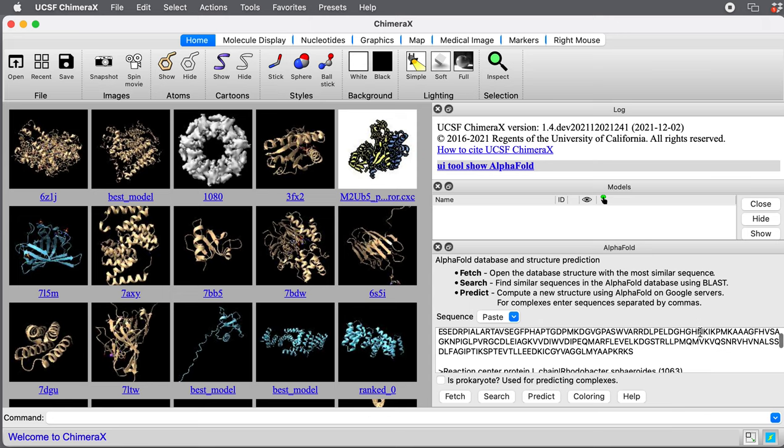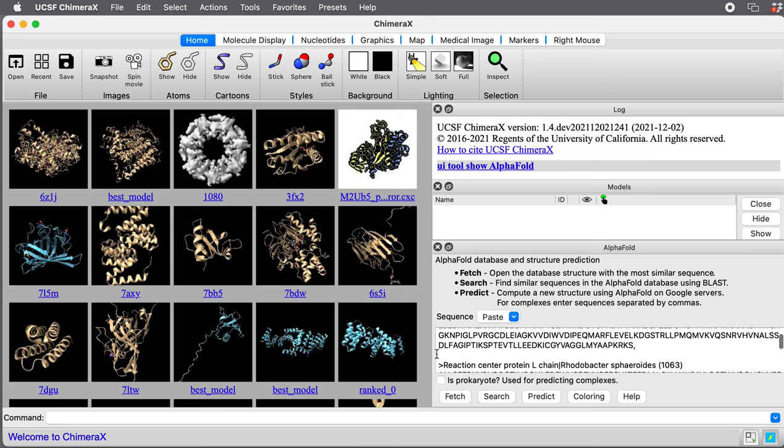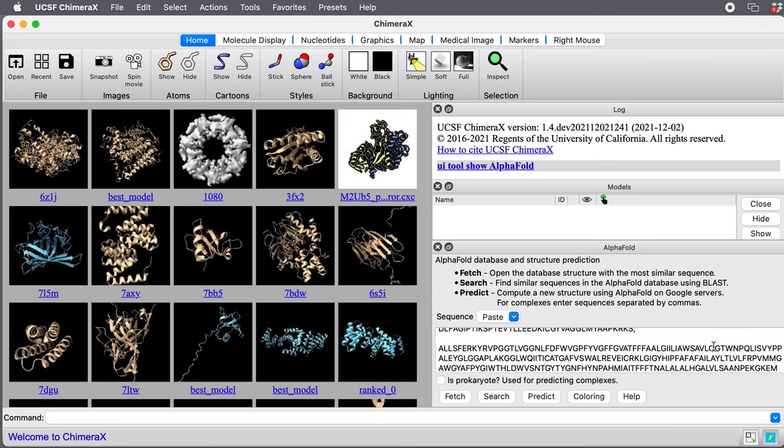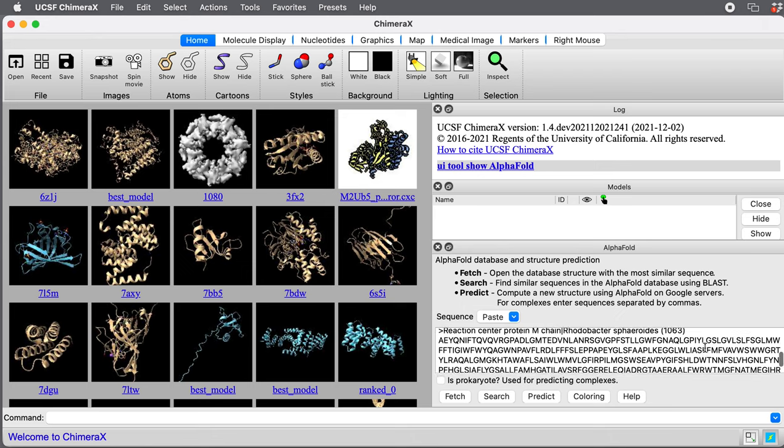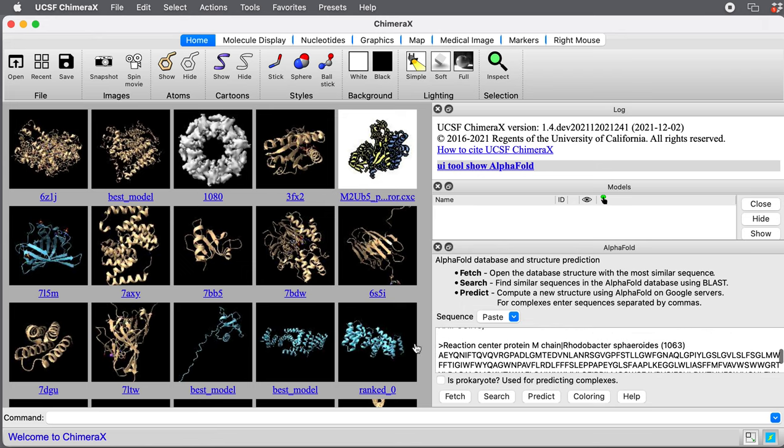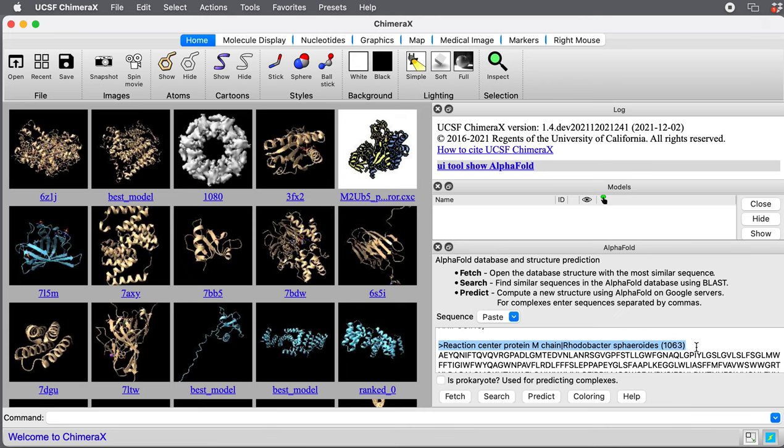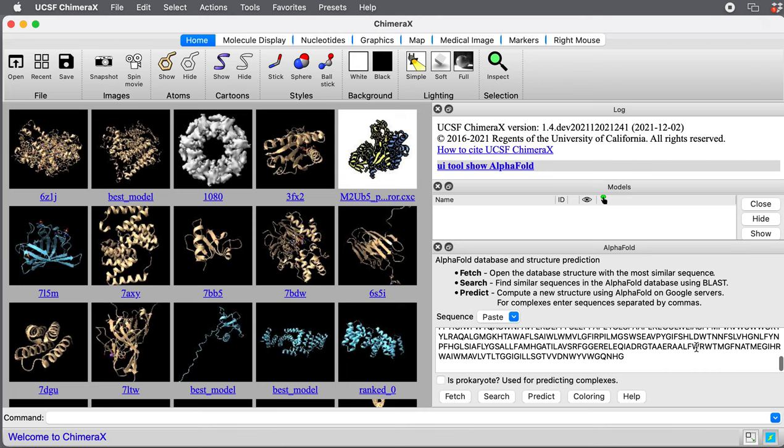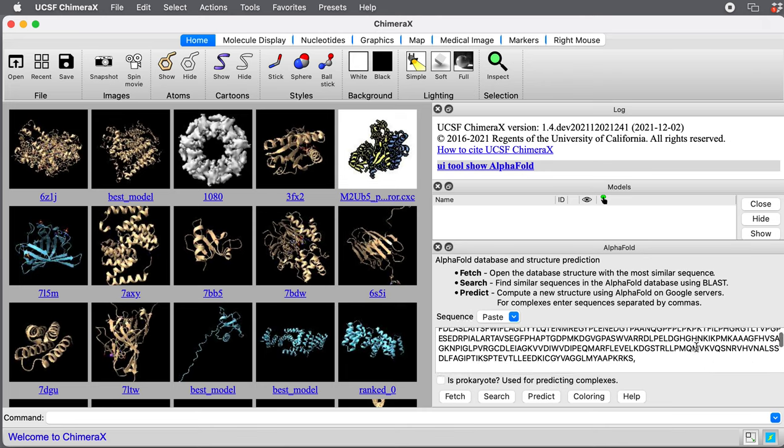The sequences should be separated by commas. The white space, the blank lines don't matter. We can have blank lines or not. Delete those header lines describing each sequence and put in commas. We've got the sequences of our three proteins pasted in.